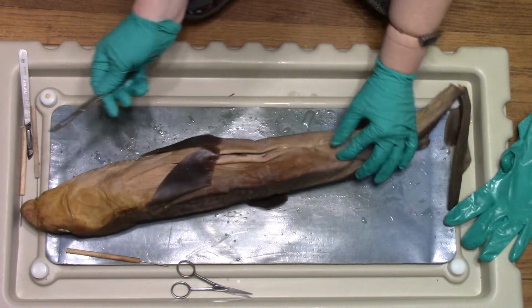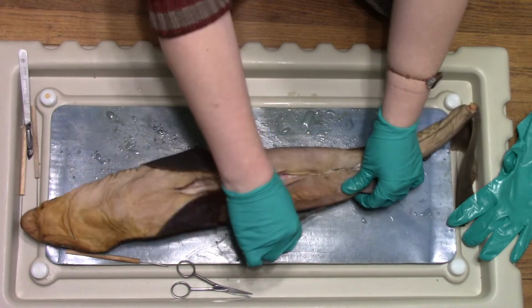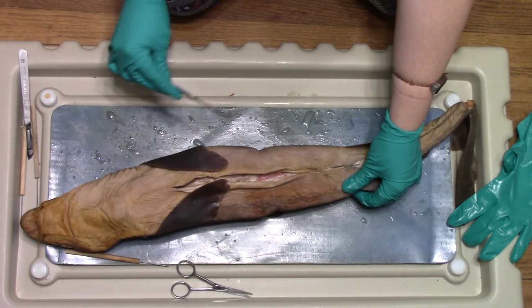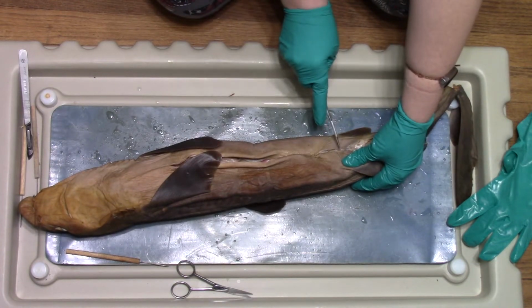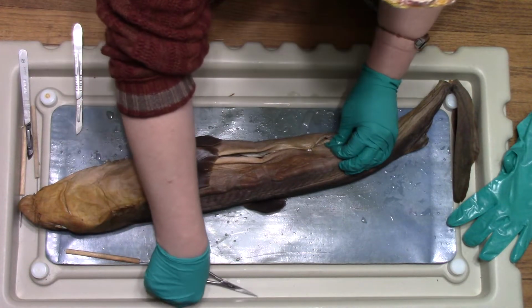Nice sharp scalpel this time. So typically you cut along the side so that you can open this whole thing out. There's already a cut here, so I'll probably just continue it and then have to cut it open twice. Take the scissors for this part.